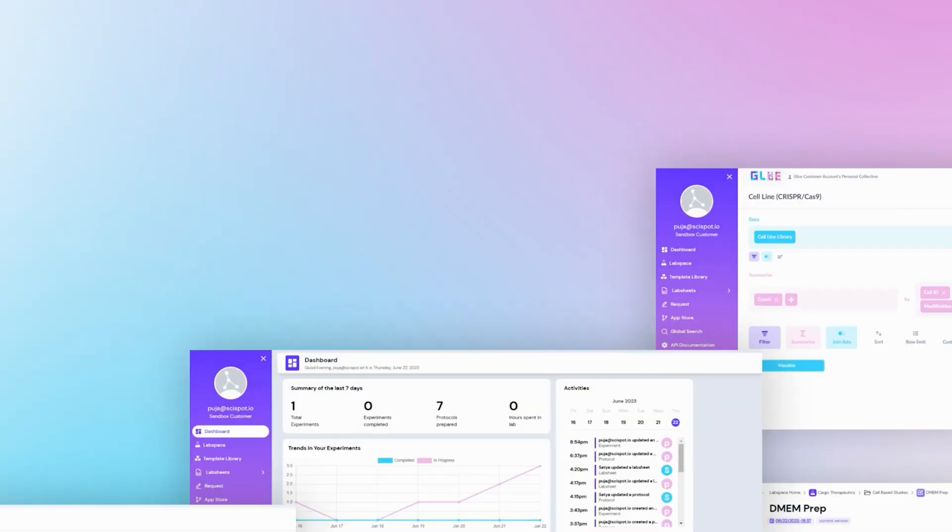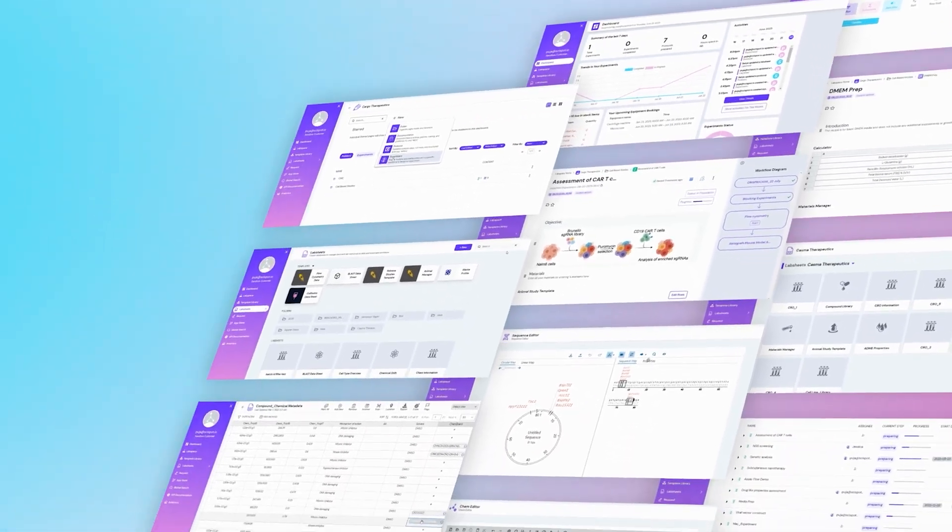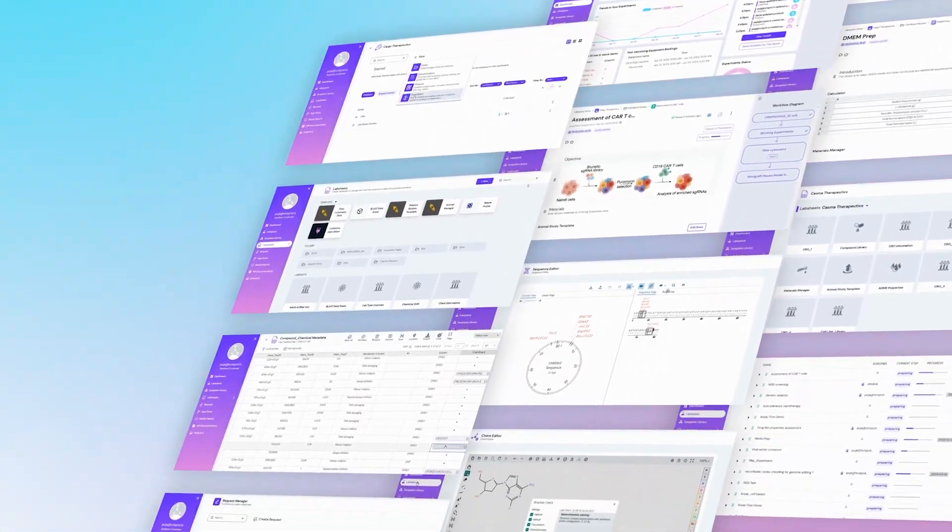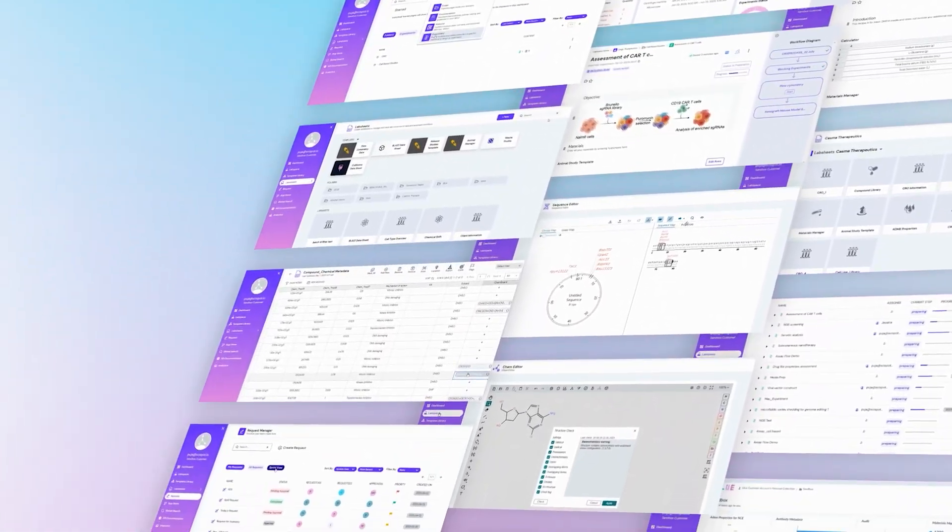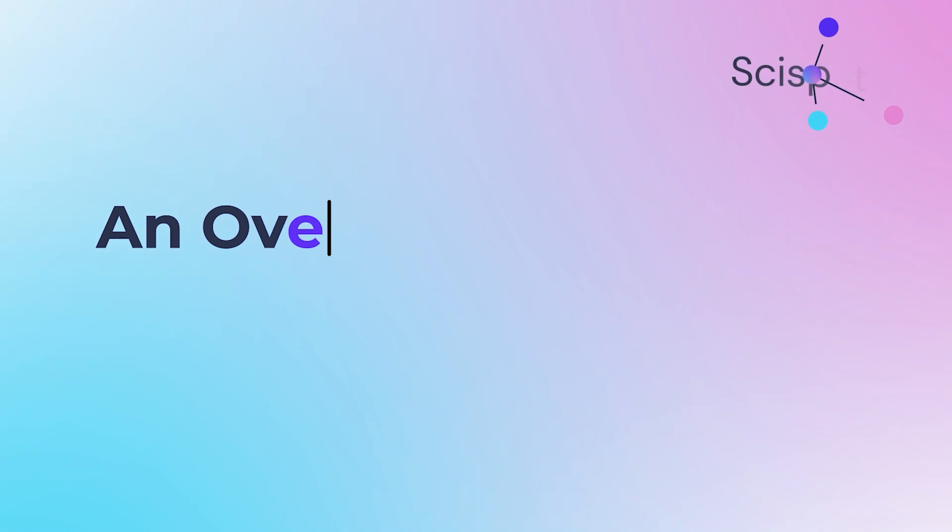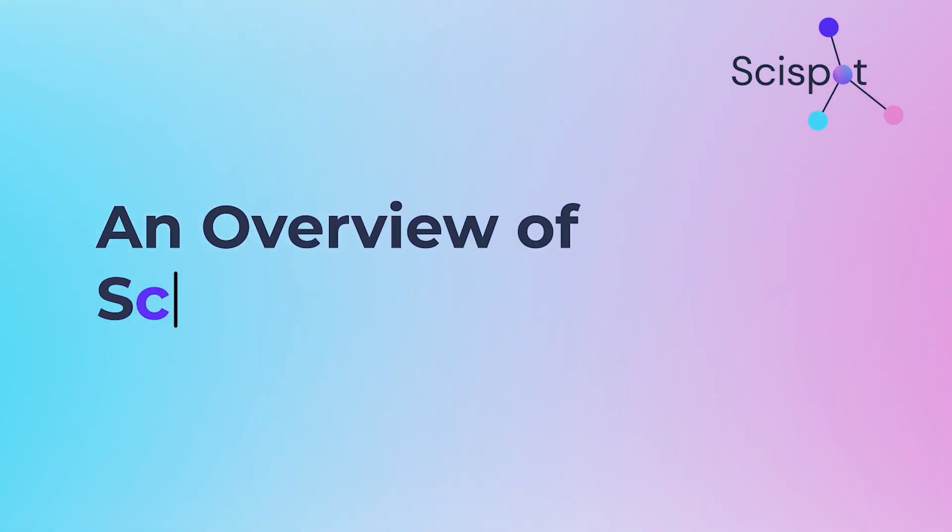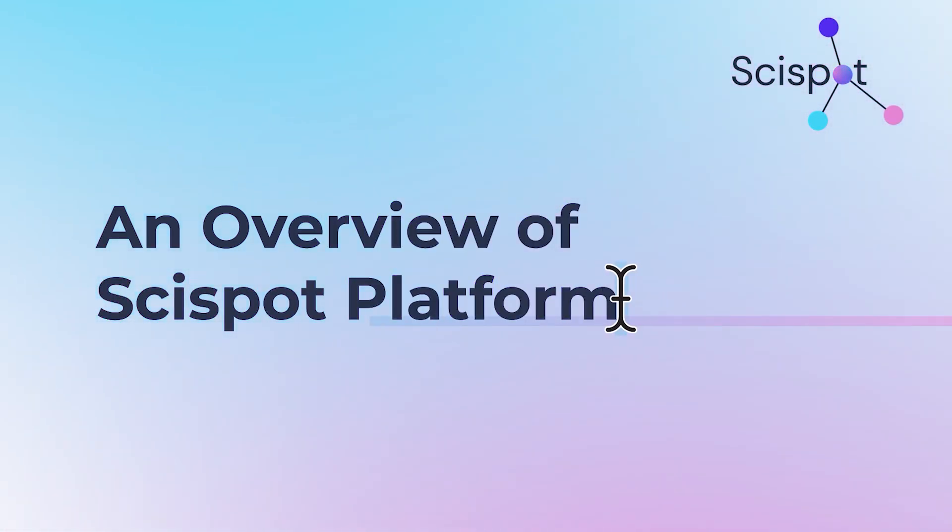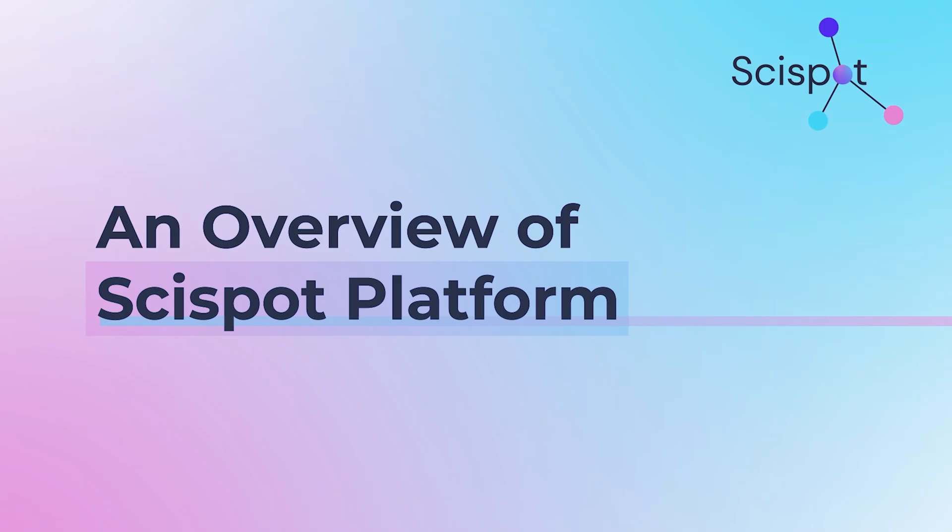This overview provides a glimpse into the comprehensive functionalities of the SciSpot platform. Should you have any questions or require further assistance, our team is always available to help.